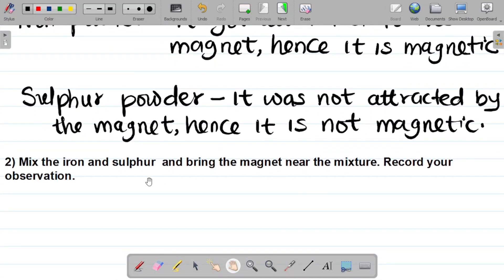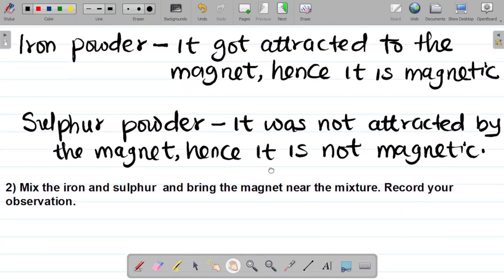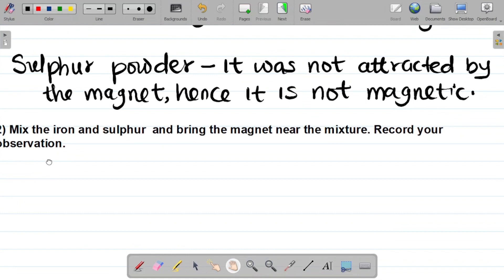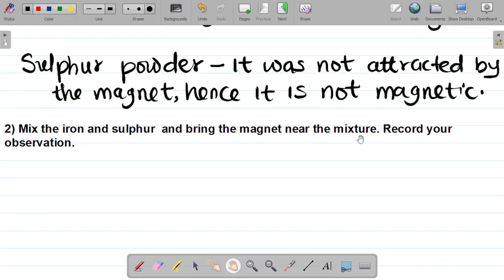Step two says: mix the iron and sulfur and bring the magnet near the mixture. So I'm now mixing both the iron powder and the sulfur together to form a mixture. They said bring the magnet near the mixture and record the observation. My observation was that the mixture was attracted by the magnet.